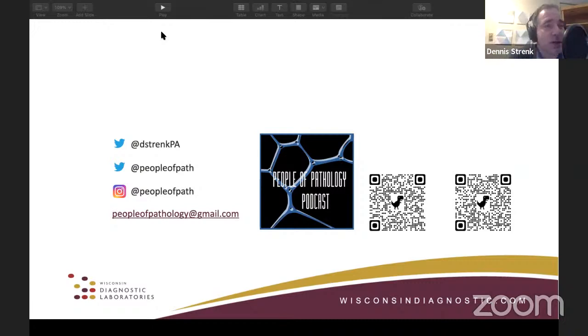Well, I would say the best color most of the time is black because it shows up the best on the slide. The exception is if you're working on a melanoma specimen, you don't want to use black, and in that case I would use blue. Blue is probably the second best color because again, it shows up very well. Green as well. You run into problems with red, orange and yellow.